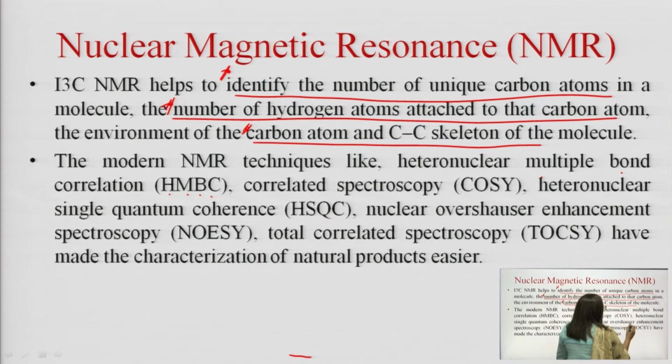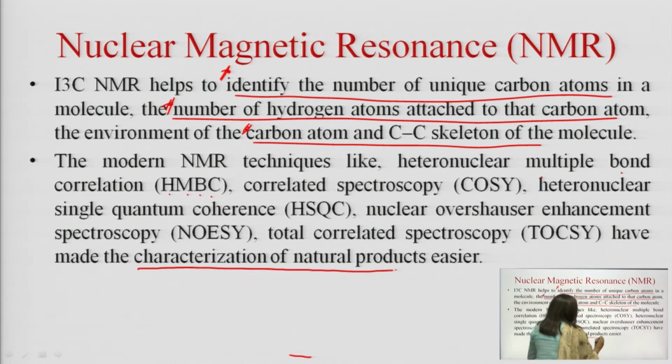Nuclear Overhauser enhancement spectroscopy, that is NOESY, and total correlated spectroscopy, also called TOCSY. They have made the characterization of natural products very easy.